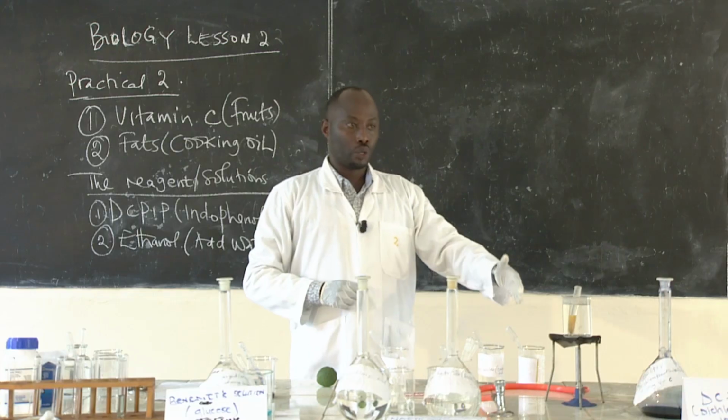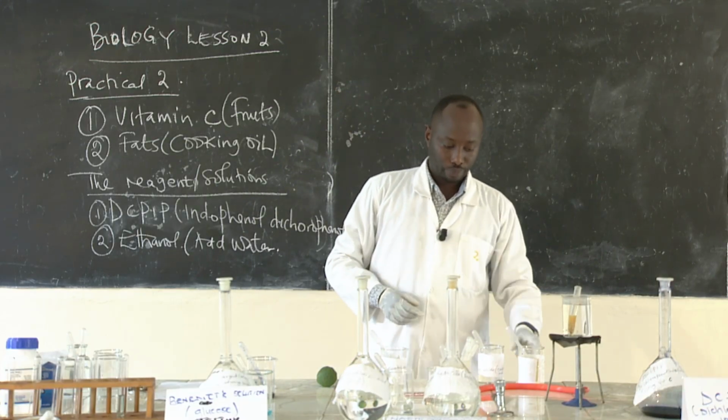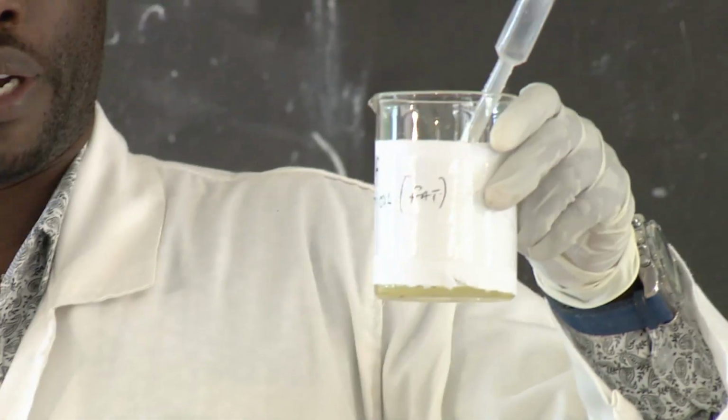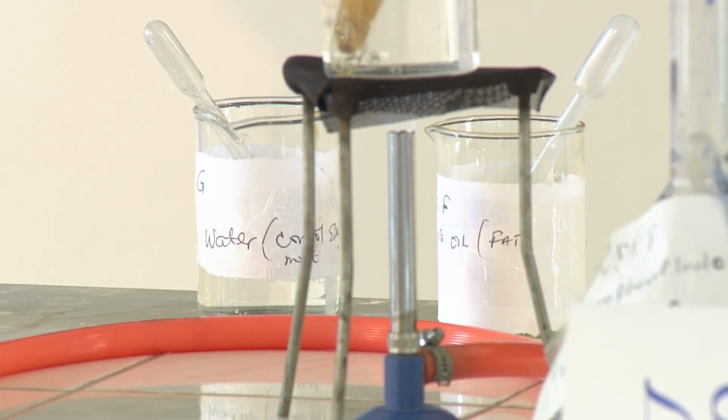So let's now test for fats. I have examples of fats here. I have cooking oil. Most of us know that we use cooking oil in very many processes.